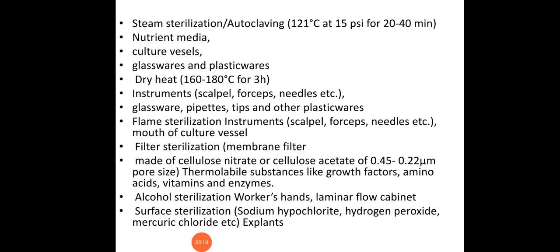Without sterilant or sanitizing, if the technician enters the plant tissue culture lab, the cultures may decompose or become contaminated. That's why, before entering the lab, first sterilize yourself.